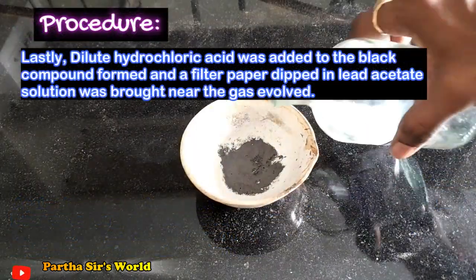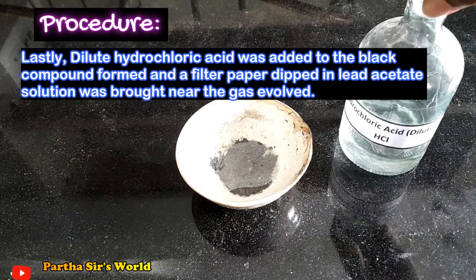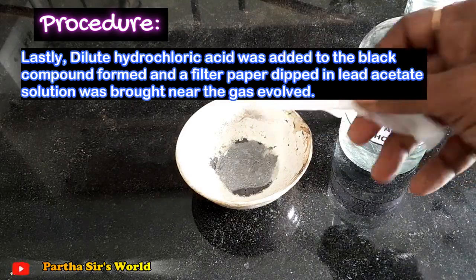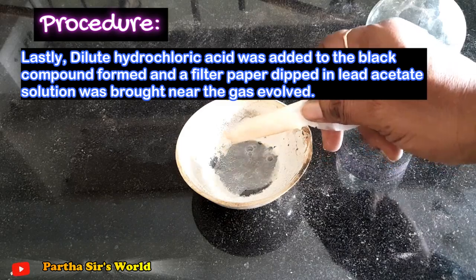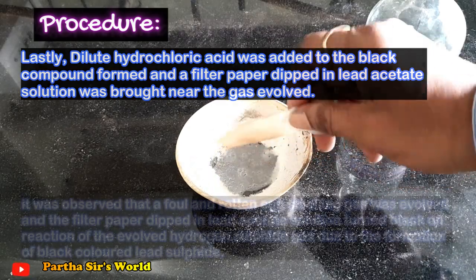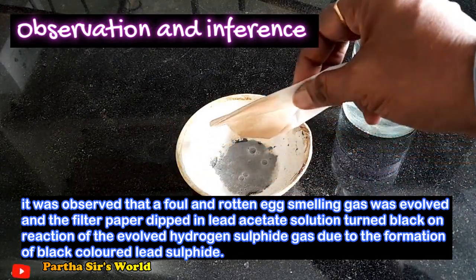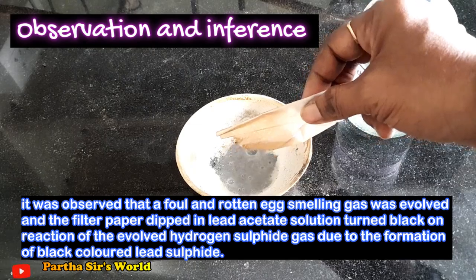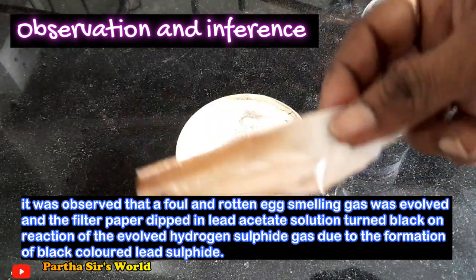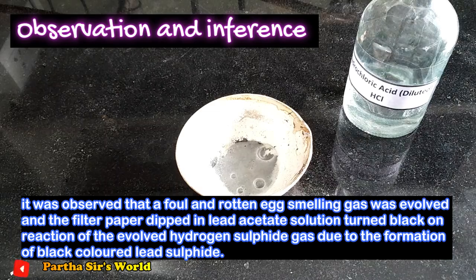Lastly, dilute hydrochloric acid was added to the black compound formed, and a filter paper dipped in lead acetate solution was brought near the gas evolved. It was observed that a foul, rotten egg smelling gas was evolved, and the filter paper dipped in lead acetate solution turned black on reaction with the evolved hydrogen sulfide gas due to the formation of black colored lead sulfide.